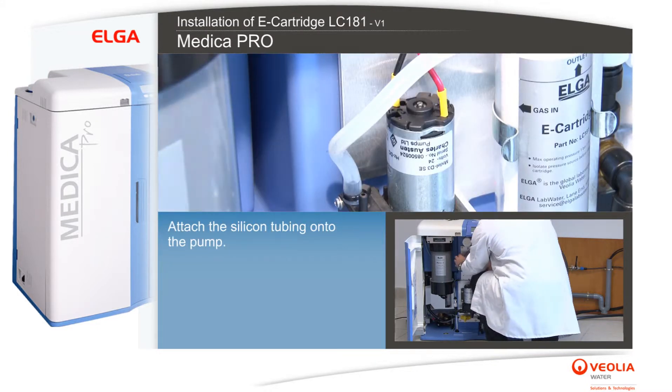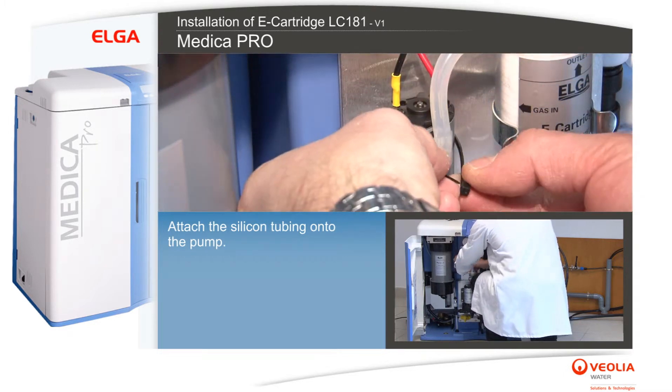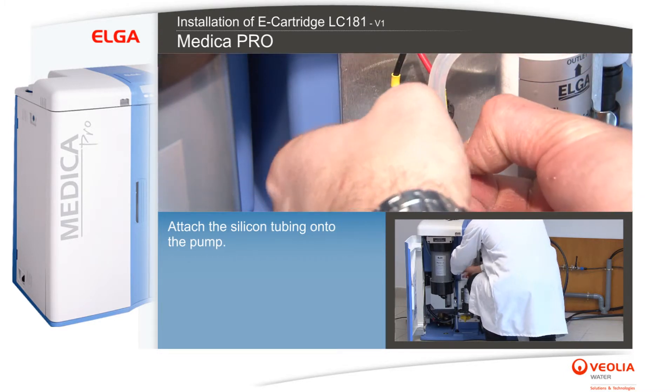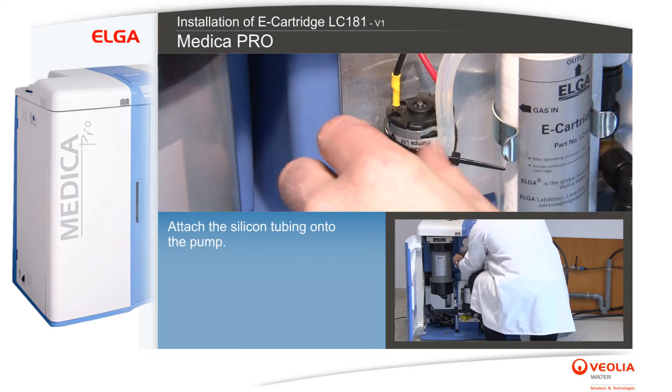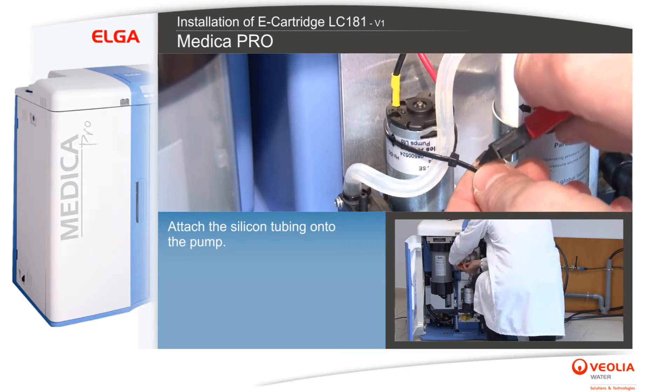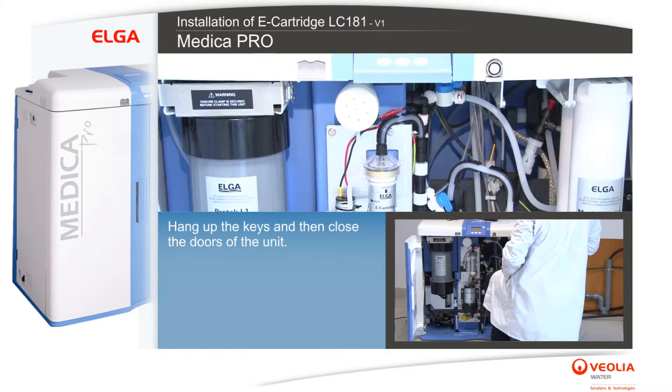Attach the silicon tubing onto the pump. Hang up the keys and then close the doors of the unit.